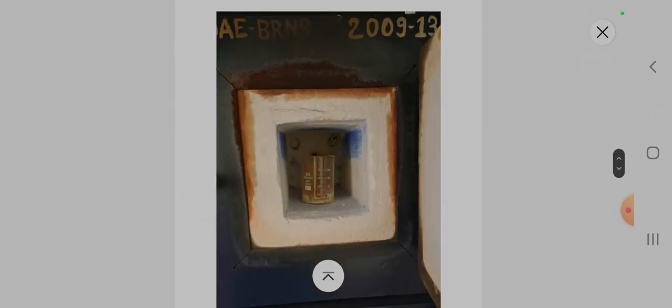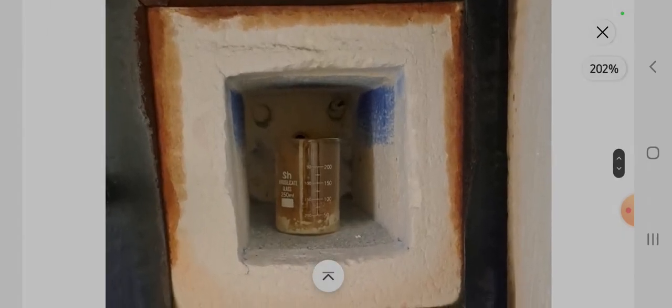So after the sample of the solution is prepared, it is placed in the furnace for heating at 500 degrees Celsius until the solution becomes free from water. Both oxidation reaction and reduction reaction take place simultaneously. Liberation of heat and volume of gas takes place. It is an exothermic reaction. The liberation of large volume of gas prevents aggregation of the nanoparticles, and this whole process takes place within 10 to 15 minutes or less than this, depending on the water taken.